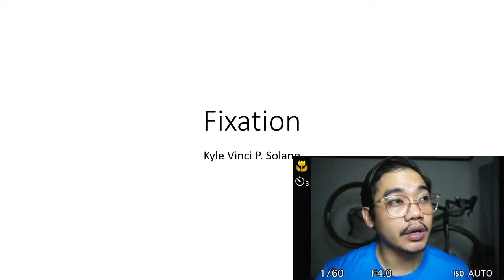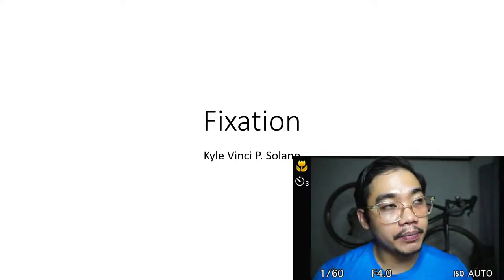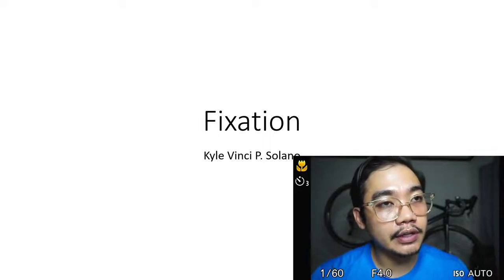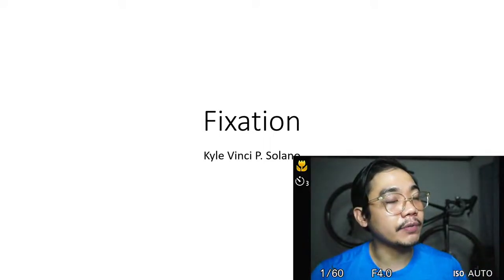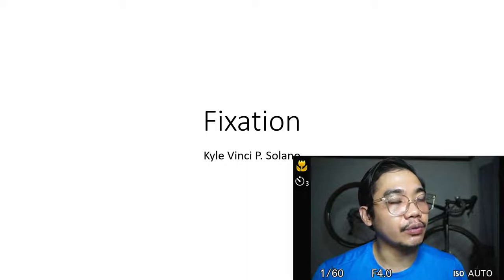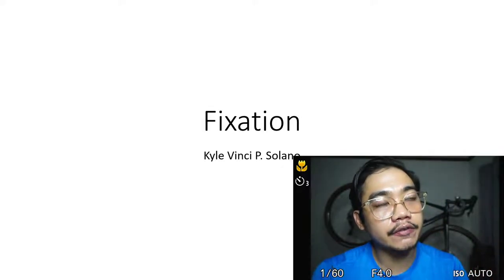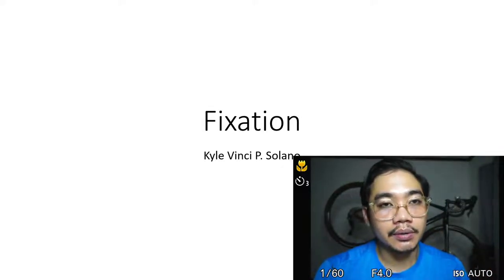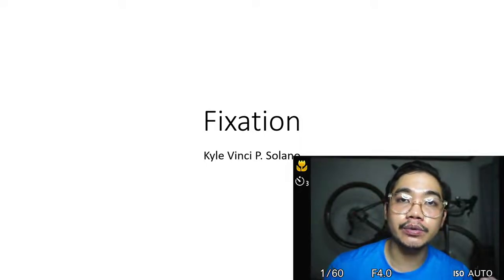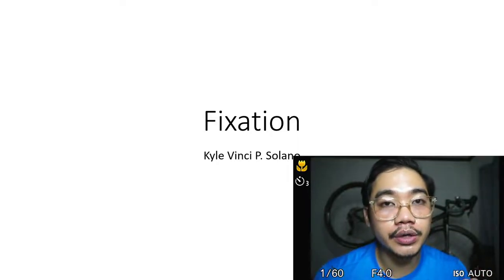One of the factors that can cause poor results is not putting the specimen into the fixative right away, because like I said earlier, once there is contact between the tissue and the fixative, all cellular processes will stop. But if there is a prolonged duration before you put the specimen into the fixative, the metabolic processes within the tissue still continue, and given that they are cut off from the blood supply, they will start to use up their ATP, leading to more anaerobic processes, a buildup of lactic acid, eventually forcing themselves to undergo apoptosis.